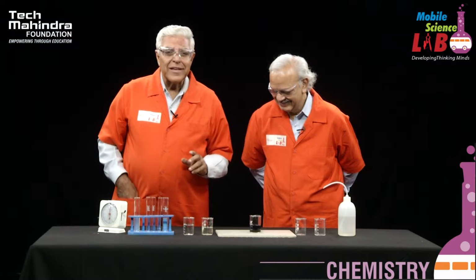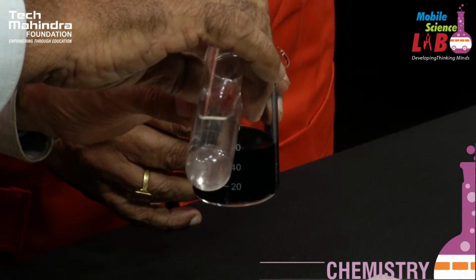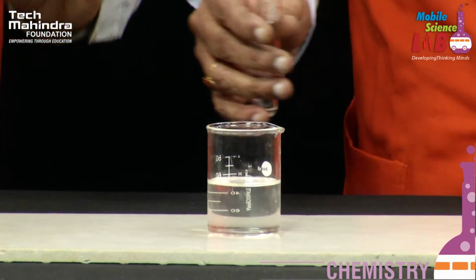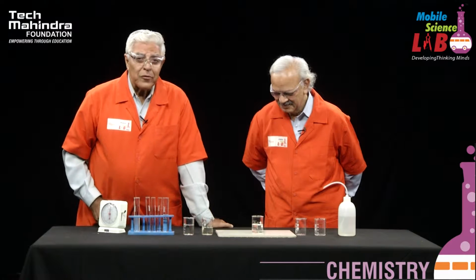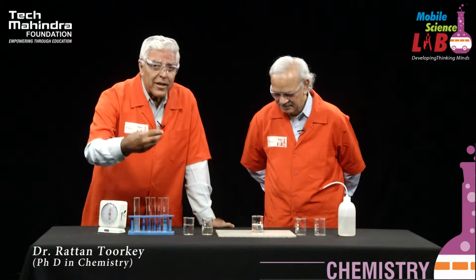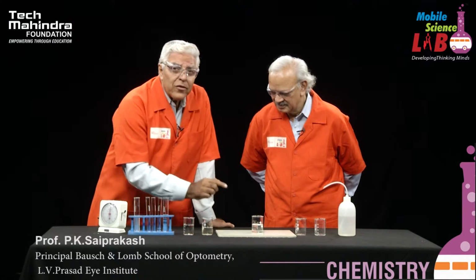And how do we know the reaction is over? By the sudden appearance of that dark blue color. Okay. So what I am going to do is, I am going to add some more hypo into this. Now students, keep watching this. We have made the color go away by adding some sodium thiosulfate, which is commonly called hypo. Now, when we have added hypo, the blue color has disappeared. If we wait for some more time, you will find the appearance of blue color again.